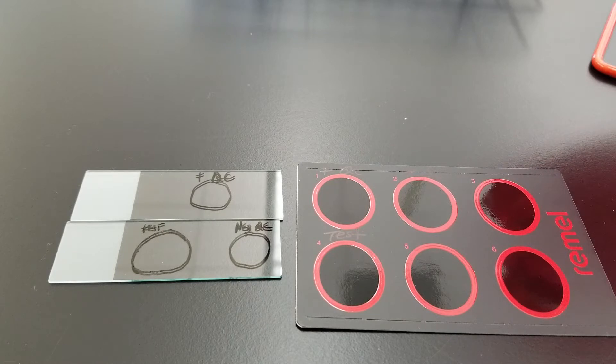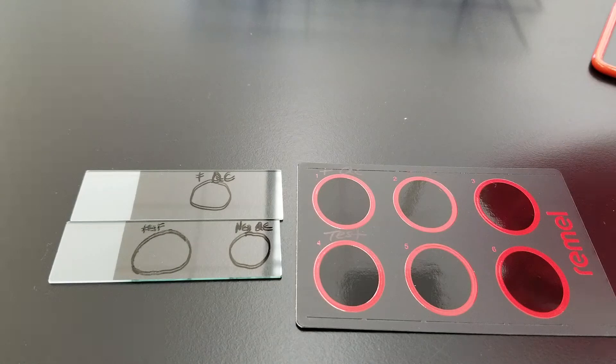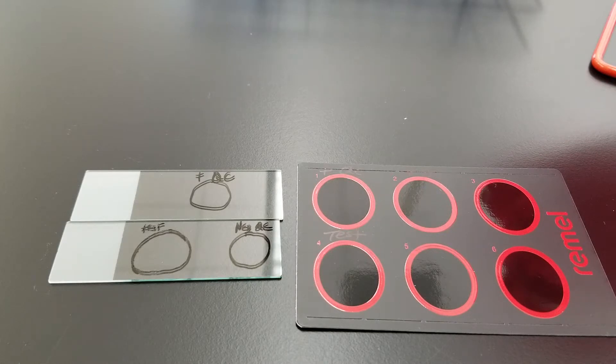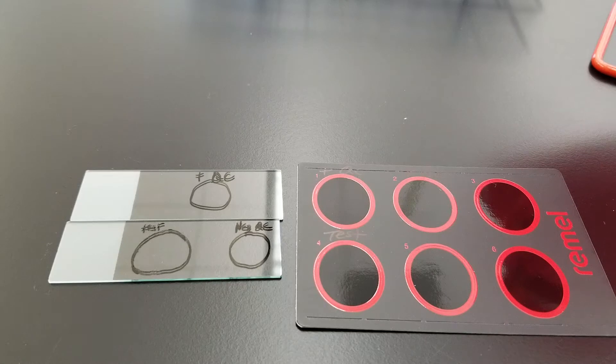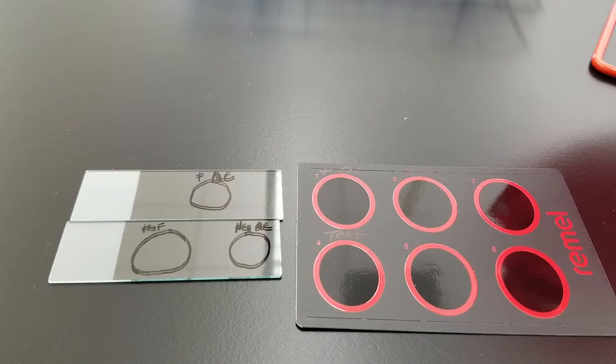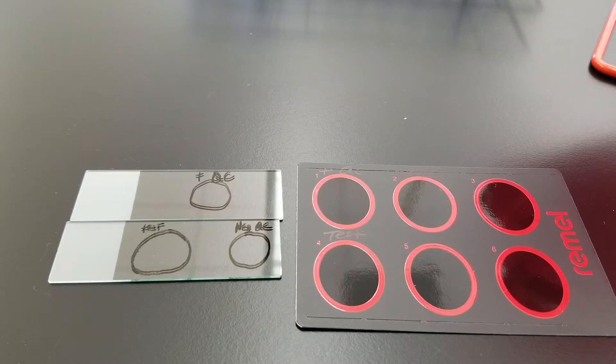This test is done first. It's trying to detect the presence of bound coagulase, the enzyme. Enzymes are proteins, and this one is bound to the bacteria's cell wall, the outer cell wall. It is used to bind to a patient's fibrinogen and turn it into fibrin, thus causing the blood to clot. This is used as a virulence factor because it enables the bacteria to basically hide in the person, so the immune system won't hunt it down. It's used as a hiding mechanism to try to avoid the patient's immune system.